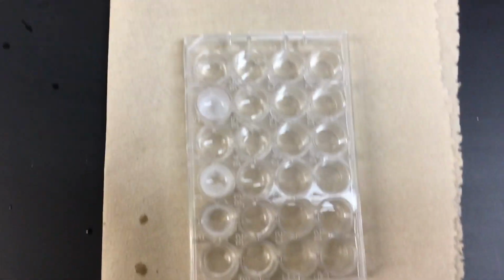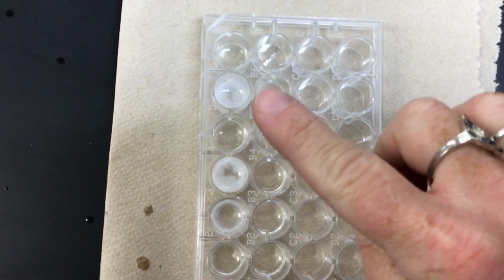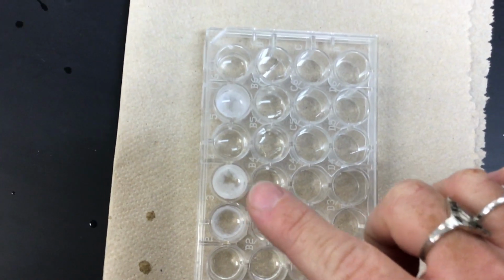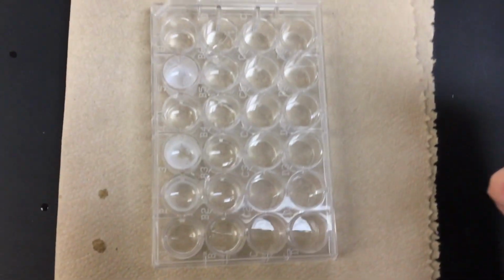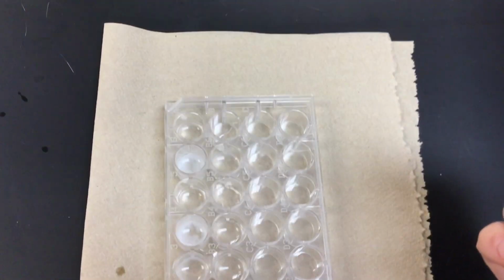Okay. And then you can see right away that there's some changes in the second, the fourth, and then the fifth. And then I'll test the silver nitrate in each of the ones in the second column.